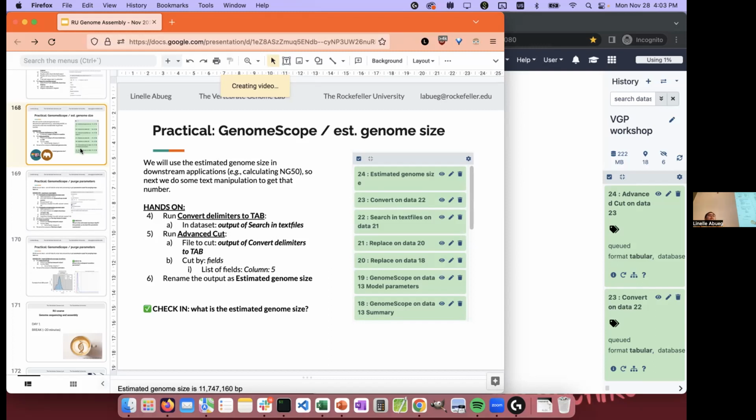Sometimes it'll have what we'll call haplotigs, which should really be an alternate instead of being represented twice in one assembly, because they represent the same heterozygous region of the genome, but perhaps they're so different that the assembler thinks they're two different parts of the genome and puts them together in the same assembly. So we want to remove that so that we have a proper, complete, not duplicated, full primary assembly. And that's the purging step.